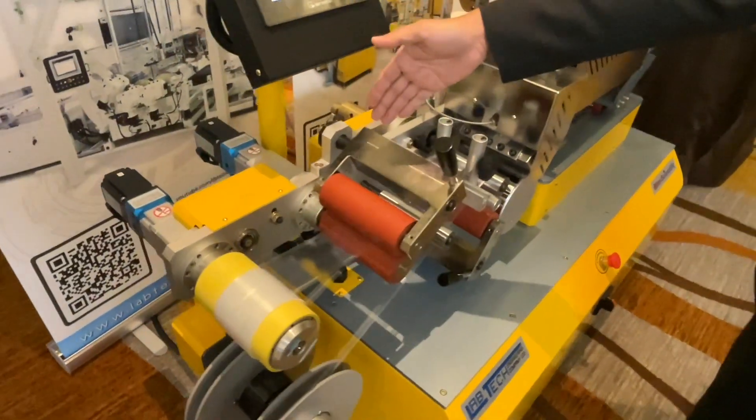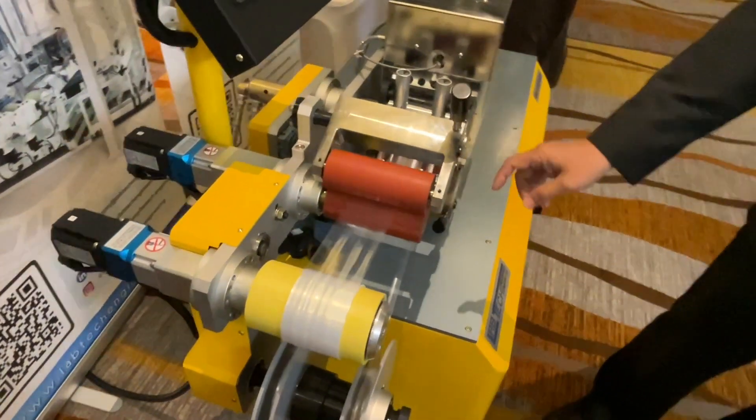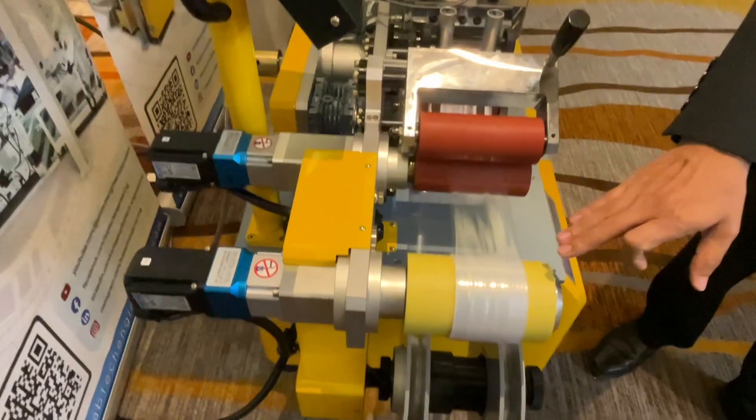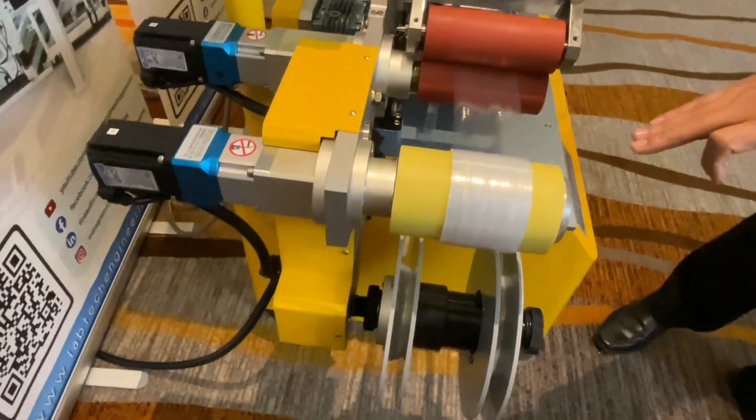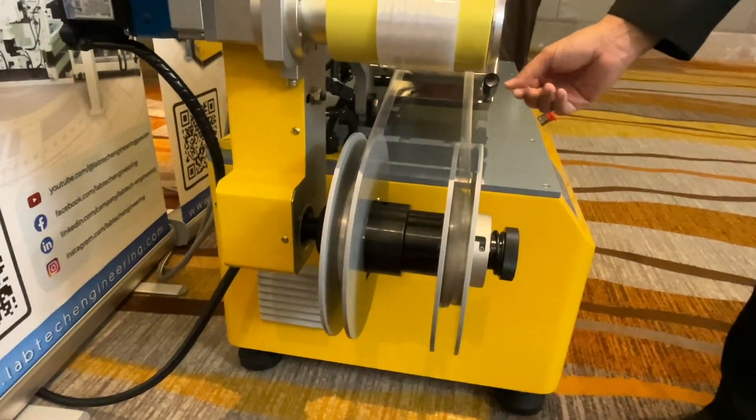Next to the nip roller, we can control the speed on the nip roller and control the thickness of the film. And also here, the winder up. The last thing is like the cassette to keep the trim.